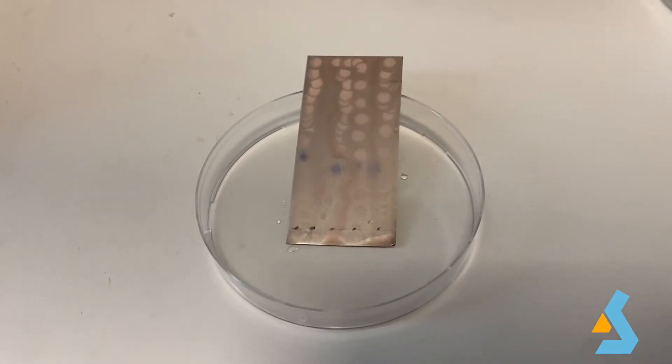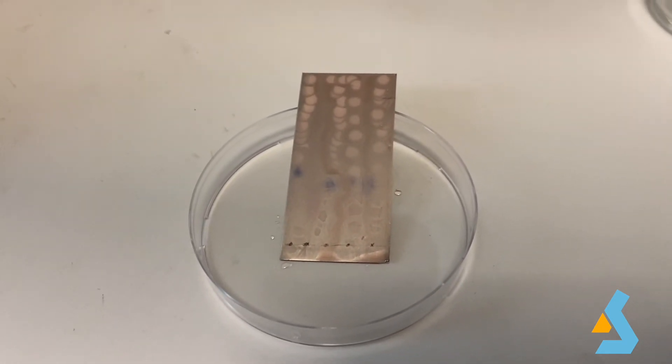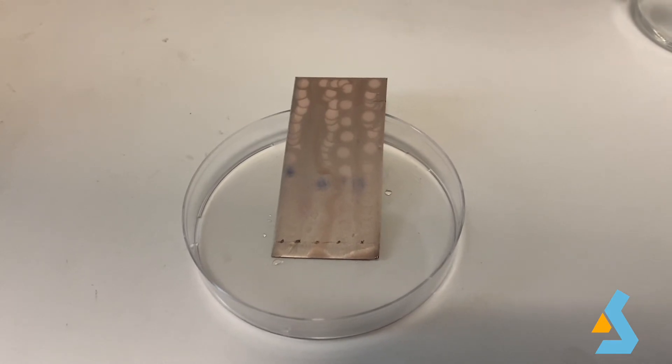After the application of the ninhydrin reagent, the TLC plate now has visible spots. Now, we will calculate the RF value for these spots and we will try to identify the unknown mixtures.